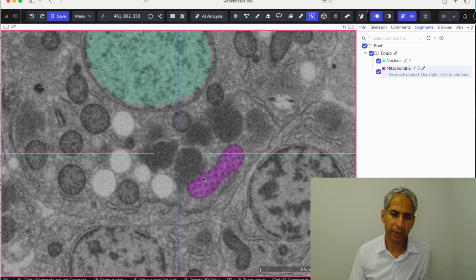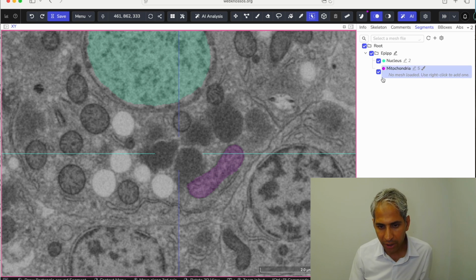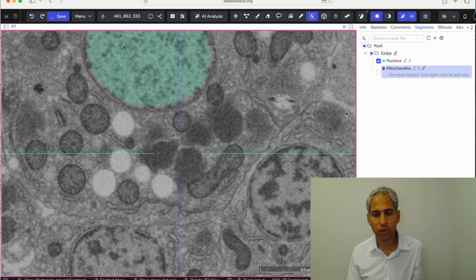This is not part of my mitochondria. I can see the membrane of the mitochondria. If I unclick this, I can see the membrane surrounding my mitochondria, that thick, dark line. That's why it was useful to annotate the cell membrane, to get used to seeing membranes. That dark line, that's my mitochondria. That's the outer mitochondrial membrane.